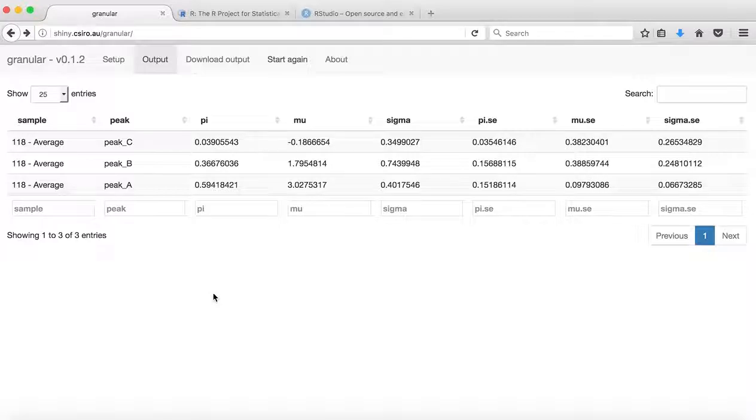This process fits a mixture distribution that gives a better proportion estimate of the granule types. In the process data, we have the proportion estimate of each granule type. So for example, in this particular data, we have about 60% that are A-type granule, 37% that are type B granule, and about 4% for type C granule.